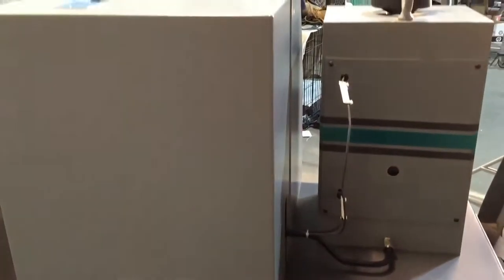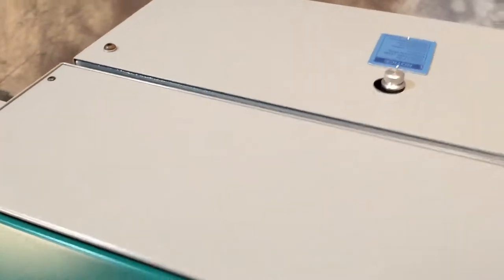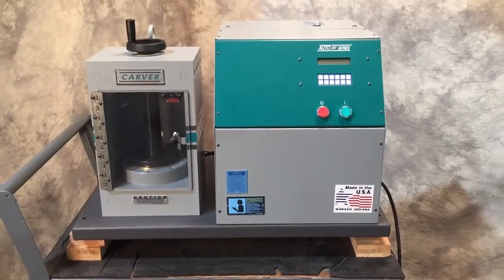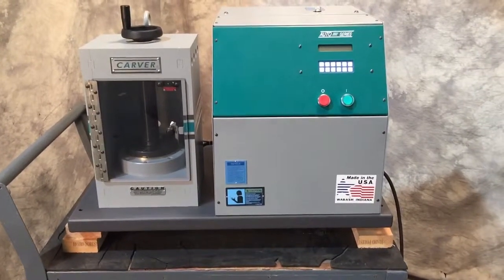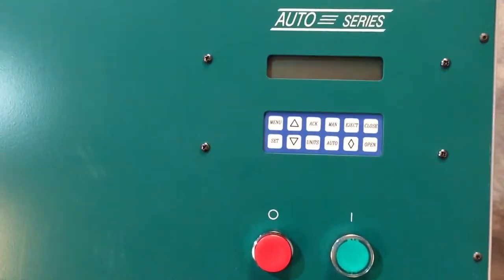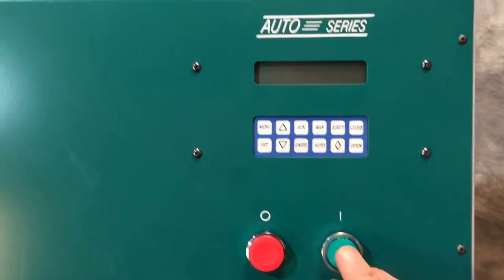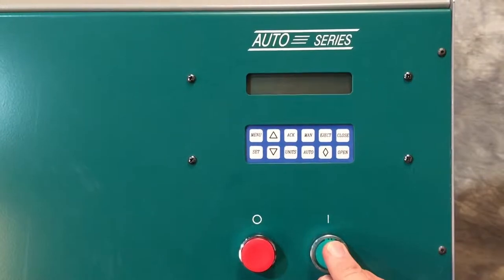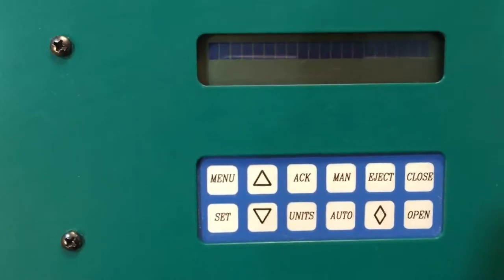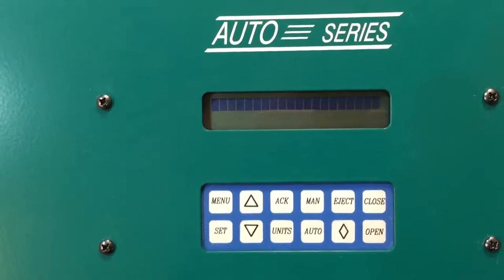Really nice. We obtained this from a government laboratory. Unfortunately, we don't know the pedigree of it other than the fact that when we go to run any type of testing on it and power it up, we get this — and that is it.